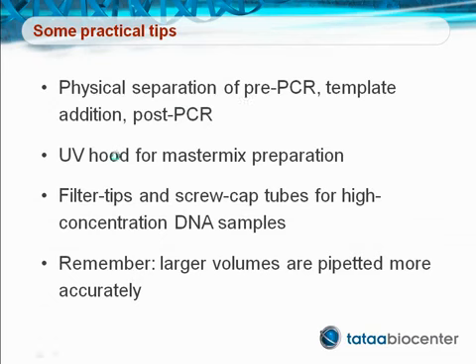A UV hood is suitable for preparing master mixes. The UV shall be on when the work is not performed in the hood to destroy any nucleic acids, and turned off when working in the hood to avoid burns.